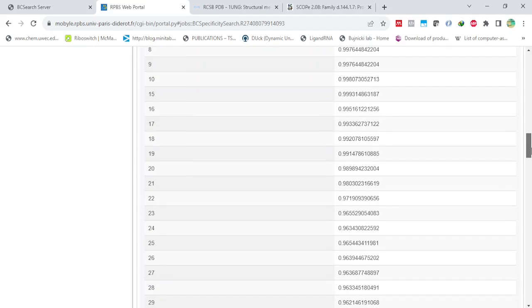So you can note the number of those residues and visualize them in your visualizer, and then check if they form a druggable pocket. You will be done knowing if the site you're targeting is specific to that protein or not. And as we said, it's according to the context of your research project and idea of design. And that's it for now.